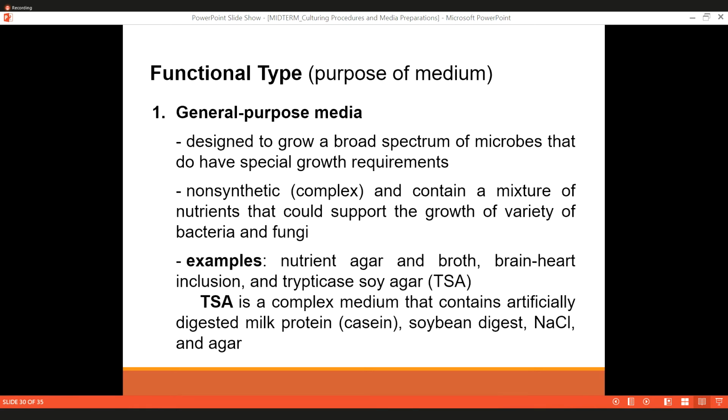So ang last part is the functional type. So we will enumerate different medias class in terms of what is your purpose nga nung kana man imo kang gigamit na media, no? So kani siya itong functional type class, dapat din ito din yung kailangan i-identify ng examiner, yung scientist, yung microbiologist natin, na depende din kung ano yung scope ng kanyang study, no? So sa media class, meron tayong media class na specific talaga according to its purpose.